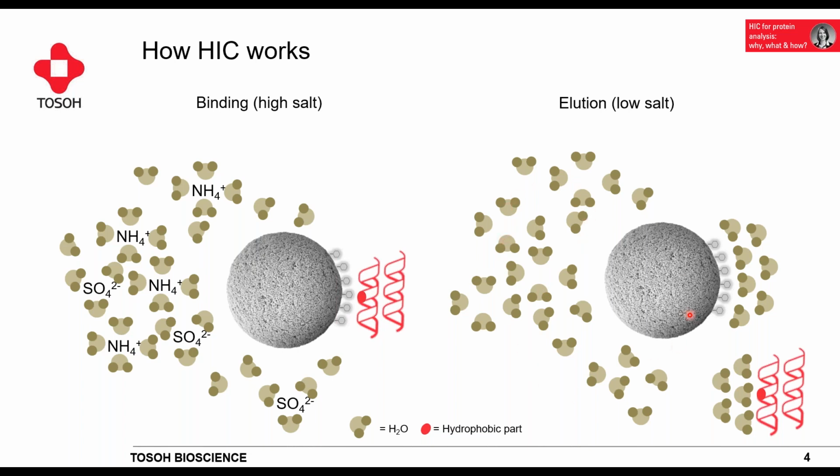In contrast, this is what I also told you in the slide before. If there is no salt anymore, we have a lot of water molecules that can solvate our protein and the hydrophobic parts of our proteins, so we don't have this accessibility anymore, and we do get elution of the molecule.